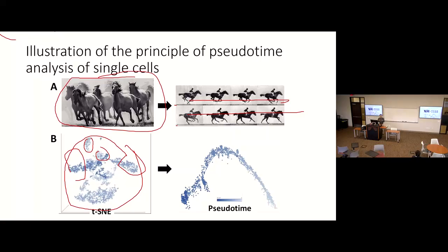But if you believe they are a series of cells, they are related by the development stage or their change from one phase to another. So you can find different ways to do this embedding. In this case, we emphasize the change of the cell states from one to another and form this kind of linear shape rather than emphasize them into subclusters.